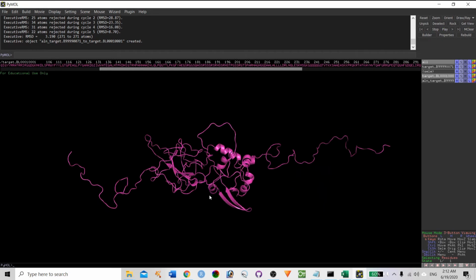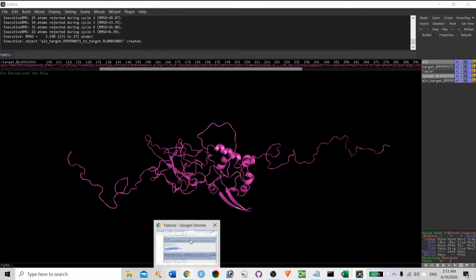Even if you increase the number of cycles, like from 1 to 100, maybe you have a chance to improve the folding of these particular side chains in the proper way. You can even rerun the loop optimization until you see a clear, highly accurate protein folding. Once you've done this, the next step is validation using the PROCHECK server. I will show you what PROCHECK is.